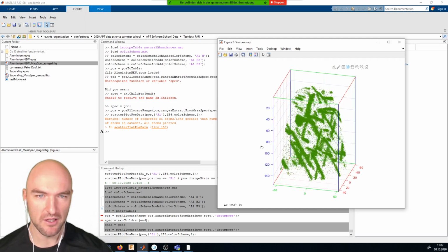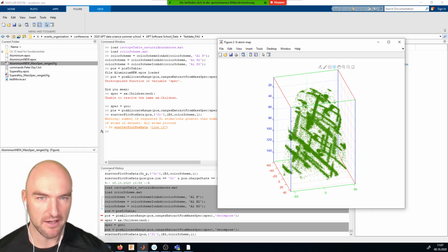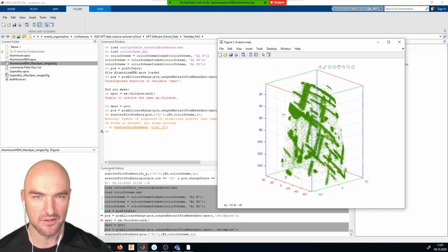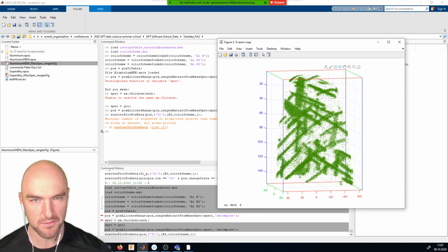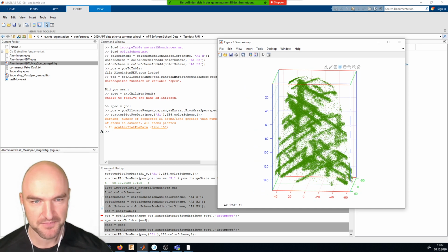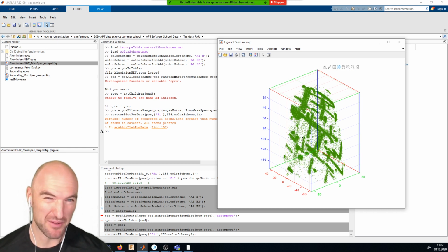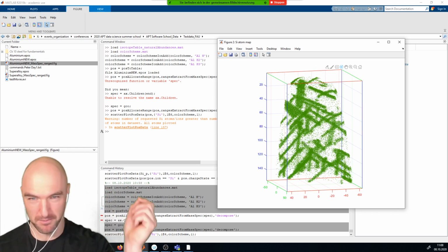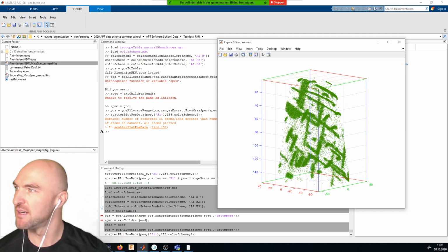Anyway, so what we could think of is just to have some kind of analysis of one of those needles. So we might be interested in how the composition goes along the needle, or how it's radially defined, and so on and so forth. And any one of you that has used proximity histograms and isosurfaces before might already be aware that an isosurface is probably not going to be very helpful if you want a radial profile, because it's going to be very noisy at the surface. We'll get to isosurfaces a little bit later.